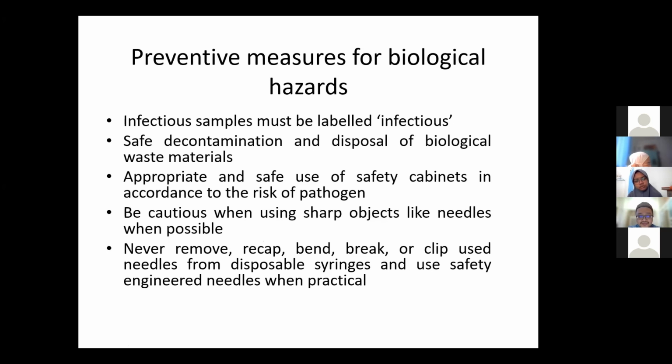With regard to the samples, infectious samples must be labeled infectious. Safe decontamination and disposal of biological waste material should be done. We must use safety cabinets and be cautious when using sharp objects like needles when possible. Never remove, recap, bend, break, or clip used needles from disposable syringes.